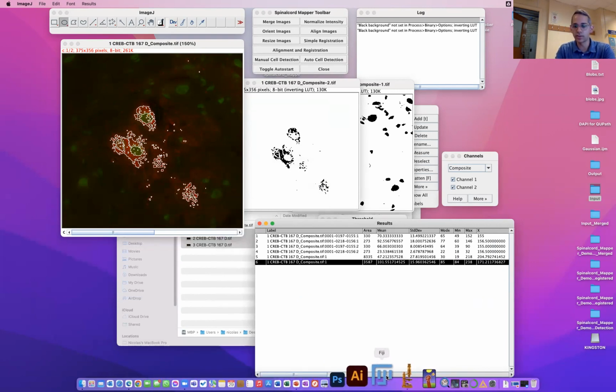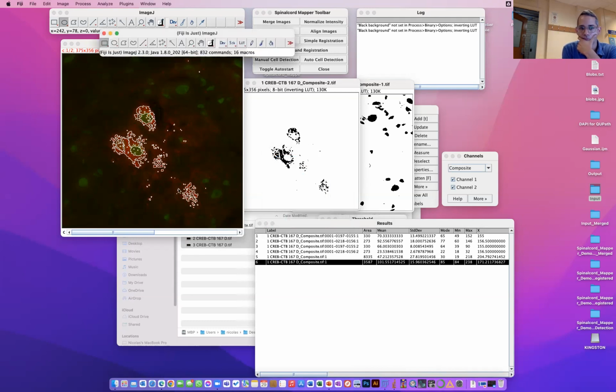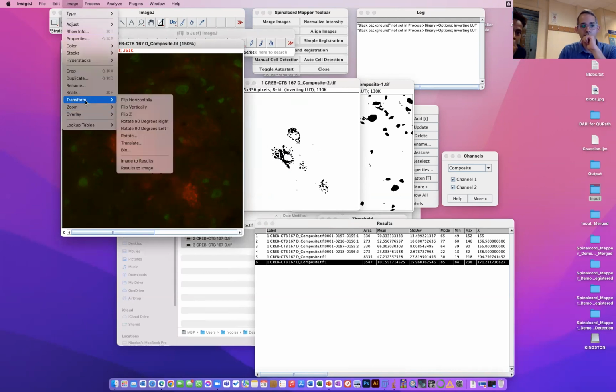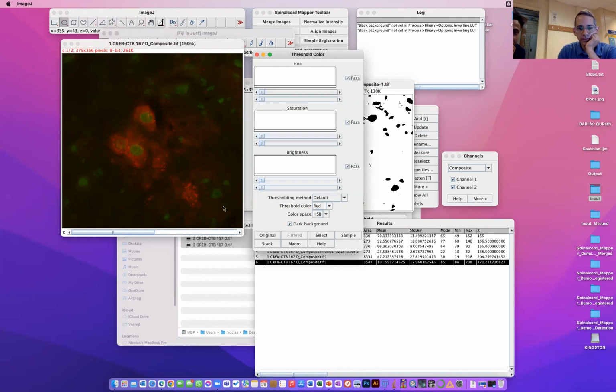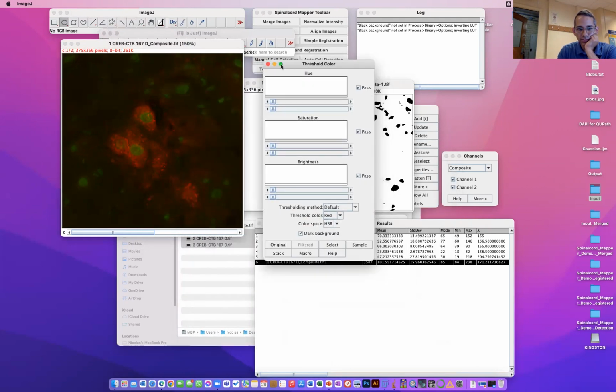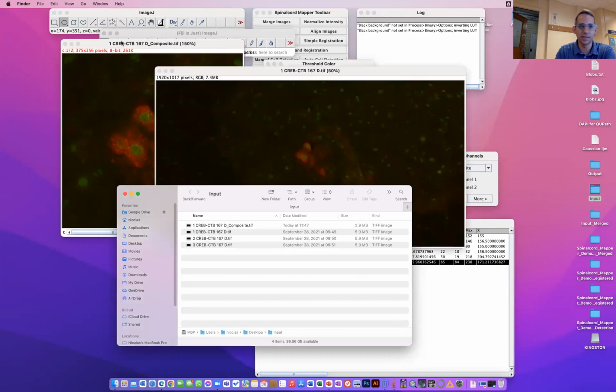I don't do colocalization and I was planning to do it in the next session, so I don't know much about it, but I have one question about the color threshold. You can make it one kind of colocalization, I think so. I remember. Color thresholding? I never tried that. Let's try. It's called image color, maybe adjust color threshold. Just color threshold, and then you can determine the threshold of each color. But for this you have to be in RGB, because now we went back to the RGB. Okay, let's try that. Never tried. Anyone has experience with that?